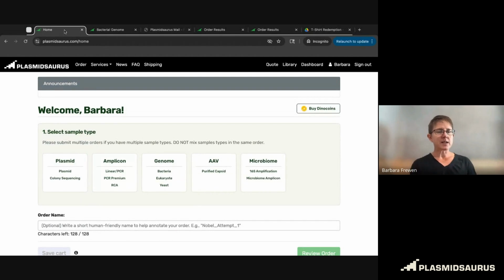This audience I know is kind of a mix. We have some old Plasmidsaurus friends. Not that you're old, you've been friends a long time. And I'm sure we have some newcomers too. And so I've selected topics, and I'm trying to use a pace that's going to meet everyone's needs. If you're very familiar with this product, I'm definitely going to tell you some stuff you already know. And if you're brand new, I might gloss over some things that are still important. So by all means, use the question box, and we'll hope that everyone can learn everything they want.